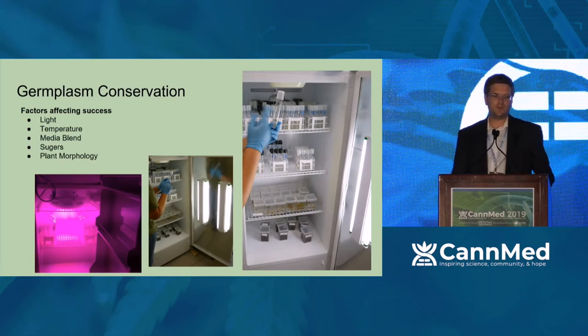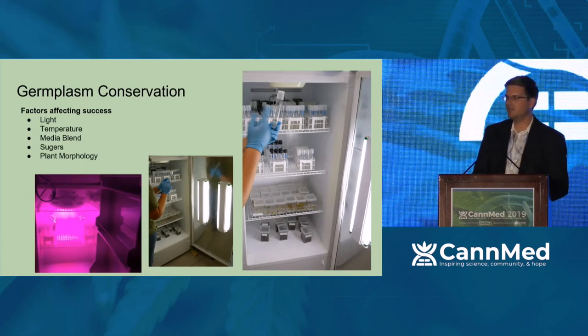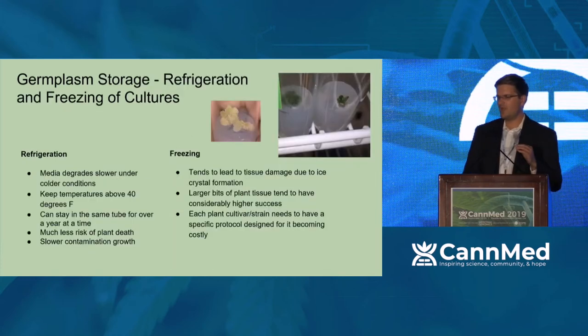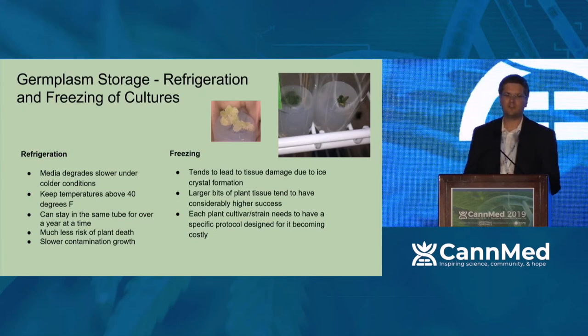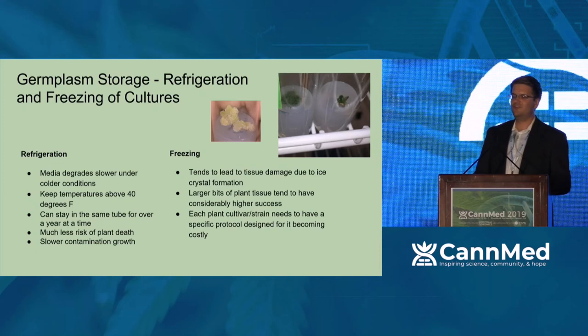You can put a plant in test tubes, stick it in a refrigerator, and it slows down the degradation of your media, in which case your plant can live a little bit longer. So when you start refrigerating your plants, there are a couple basic rules I've learned from literature and other things that you need to pay attention to. Do not go lower than 40 degrees on your plant tissue. You're essentially starting to freeze it and you'll get a lot more cell death.